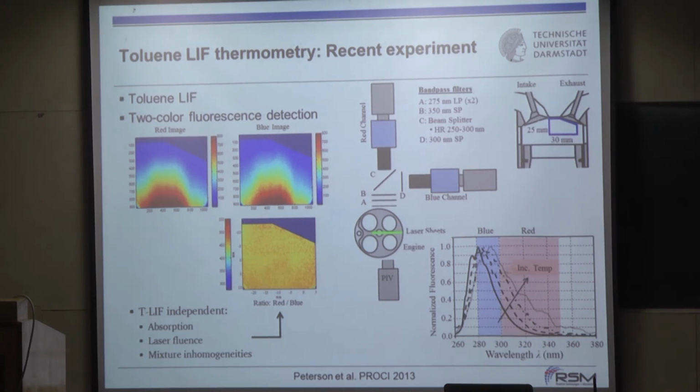And for flame intensity, are you comparing any wavelength of the two different flames, or how are you measuring this flame intensity? Is it possible to measure the flame intensity? Measure the flame intensity. You mean chemiluminescence? Yes, sure.